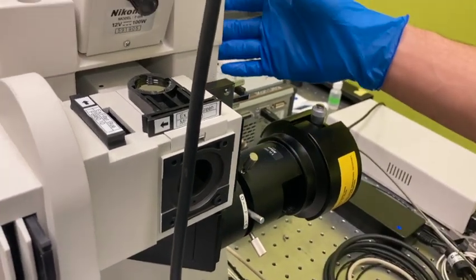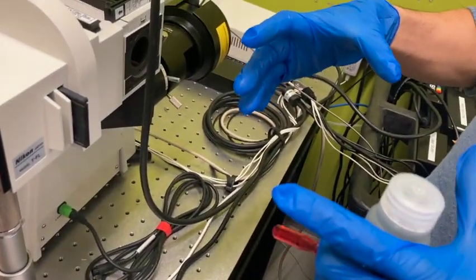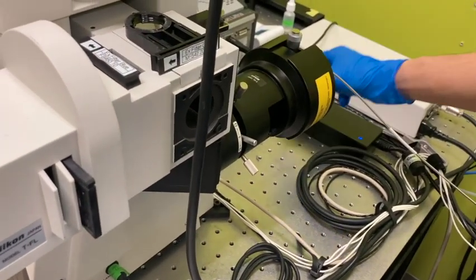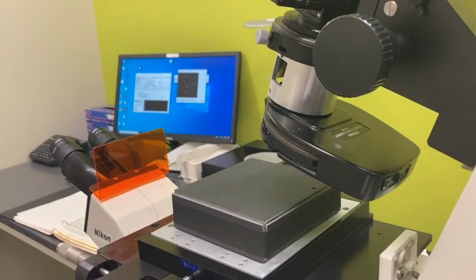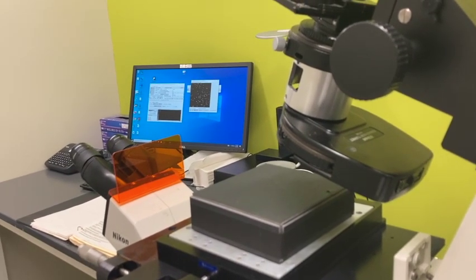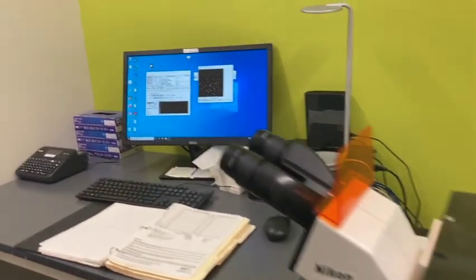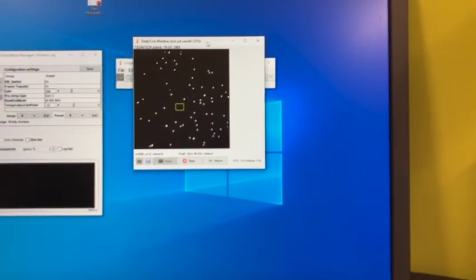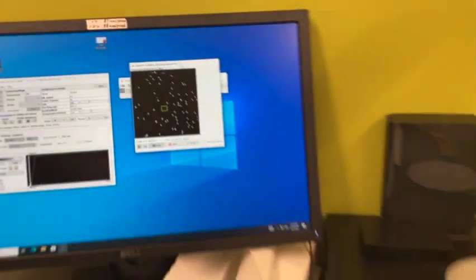Again, it's very similar to the IM. The field diaphragm is how big an area you want to illuminate, to excite the ensemble. And if I close it a little, please. Yeah, you can see the change at the edge of the camera. So I turn it off, and then it excites a smaller area, going up, going down, going out. So that's our field diaphragm.